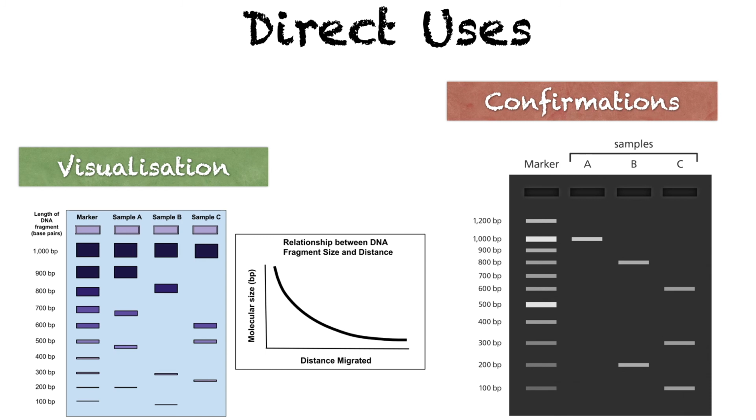We compare the sample bands in the gel with a marker. You can see the marker bands, in marker size, on the very left-hand side of the first picture, and with reference to the marker, we compare the other bands that appear in the gel and we visualize how our reactions have gone, and how our experimentations are going. And another form comes as confirmation.